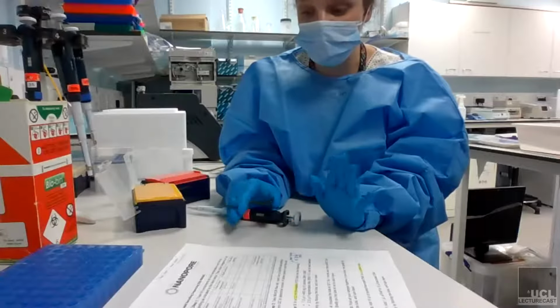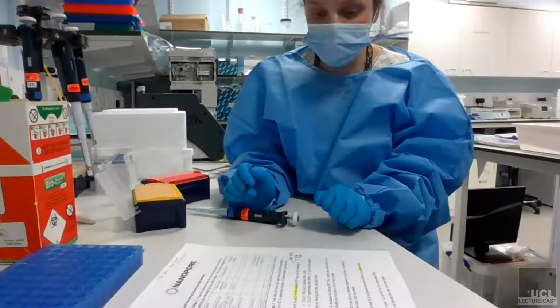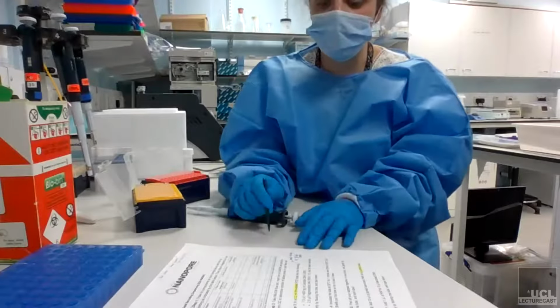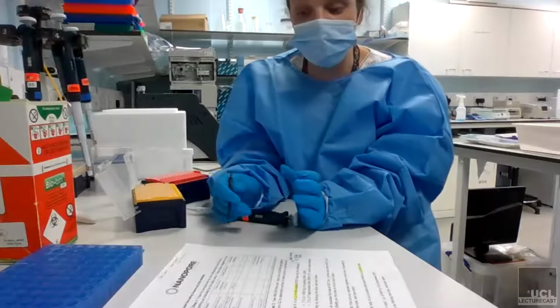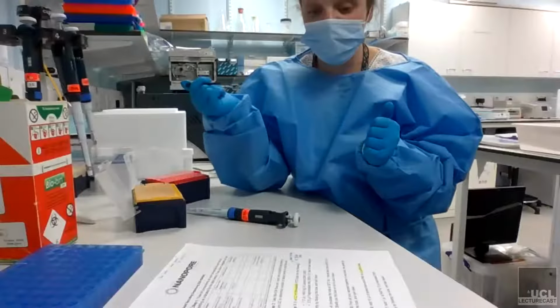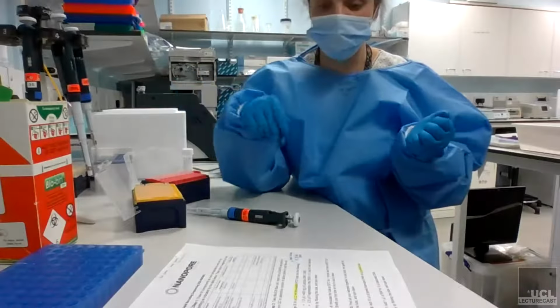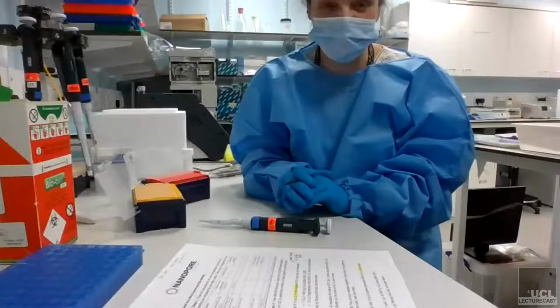It should take us, usually it would take maybe an hour or so. It might take me a bit longer because I'm explaining it. But yeah, so the beads are in other protocols. I mean, if for instance you wanted to specify a really certain size of DNA, or you wanted to make sure that all of your DNA was exactly the same size, you could do a bead wash before. But as I say, because in theory you should have a good amount of DNA to start with, you don't really need to do it for this protocol. But yeah, that's the reason. Does that make sense? Okay.